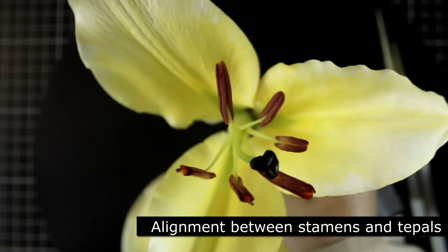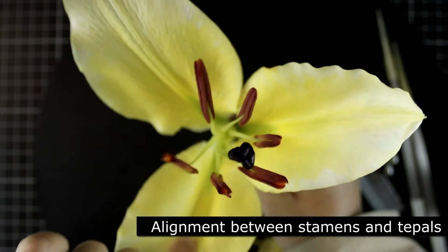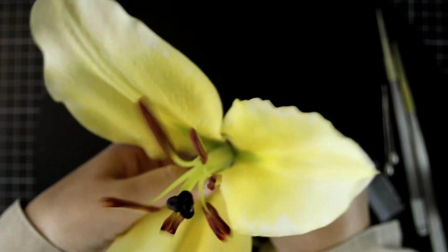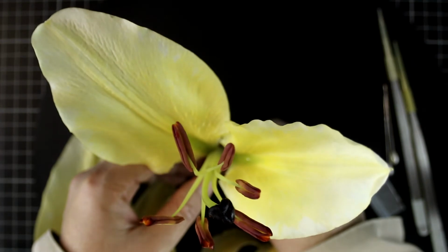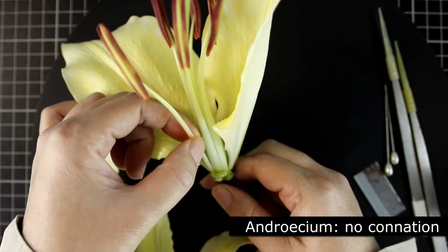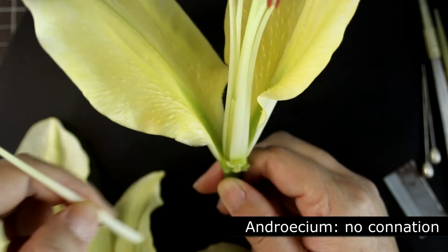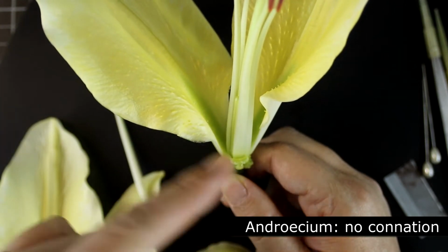And this is the tepal in the inner whorl, and you can find that it is also aligned with another stamen. Okay, now I remove it. For the stamen, the androecium, you can see that they're well separated. So I can remove it without hurting the other stamens in the androecium.